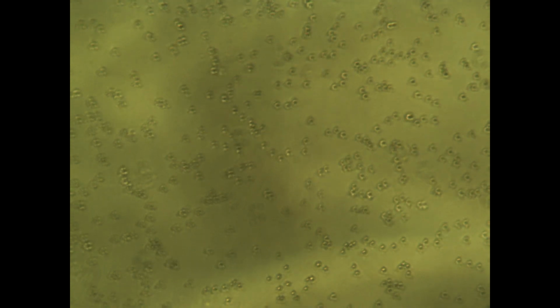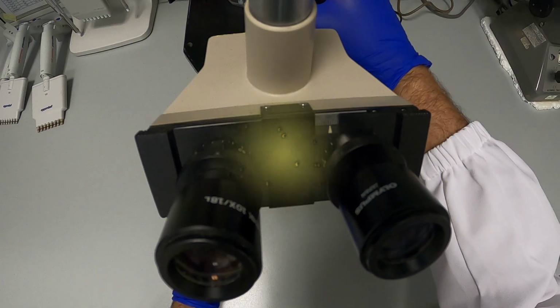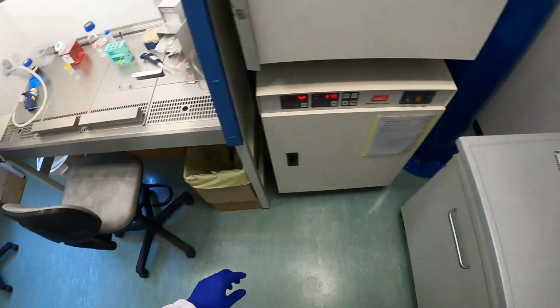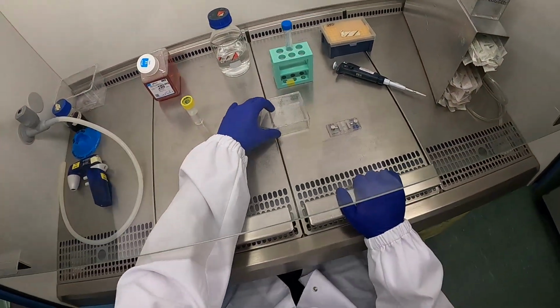And if you use a lower magnification, you focus a little bit, you will see that more or less all the cells are detached and in suspension. So perfect, ready to stop the trypsin activity by adding a medium.